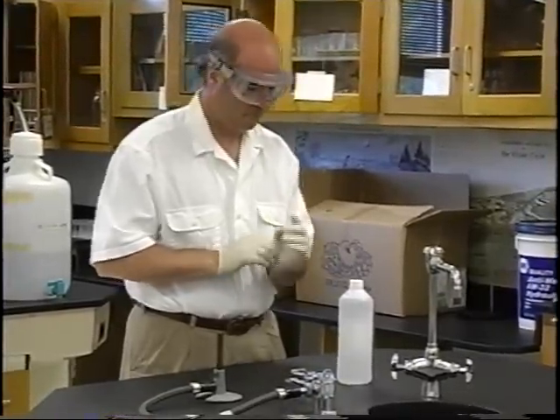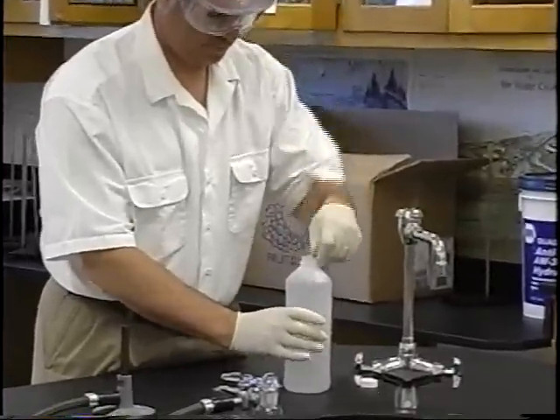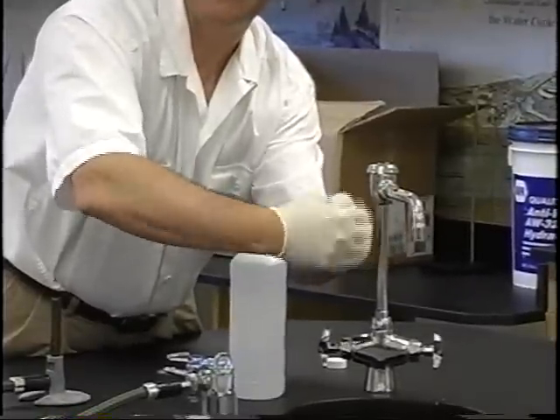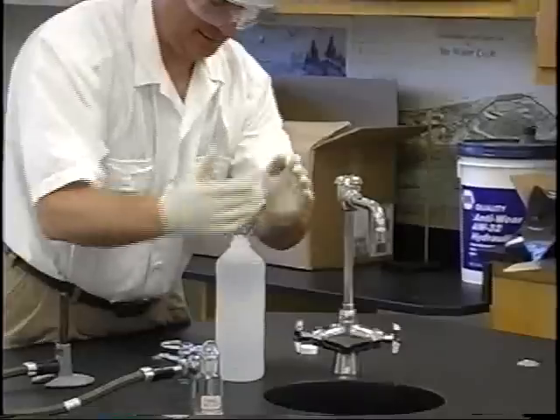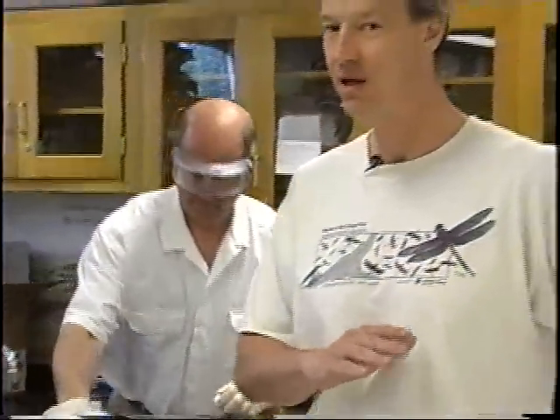What he's going to do, Mr. Piskel, is take rubbing alcohol and wash his hands with it. What he's doing now is killing any other bacteria that might be in this environment. There's bacteria all over every place. I don't care how clean you think everything is. It's all over every surface we work with all day.